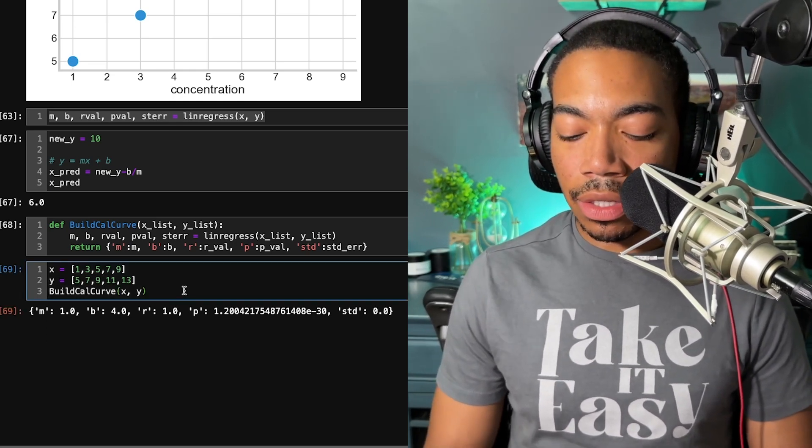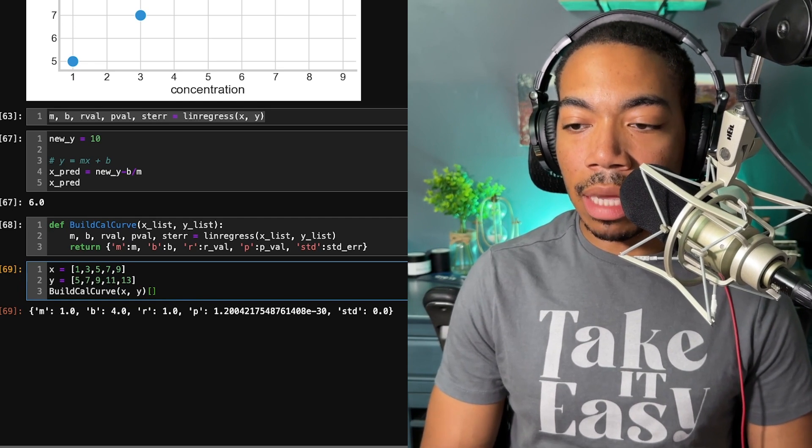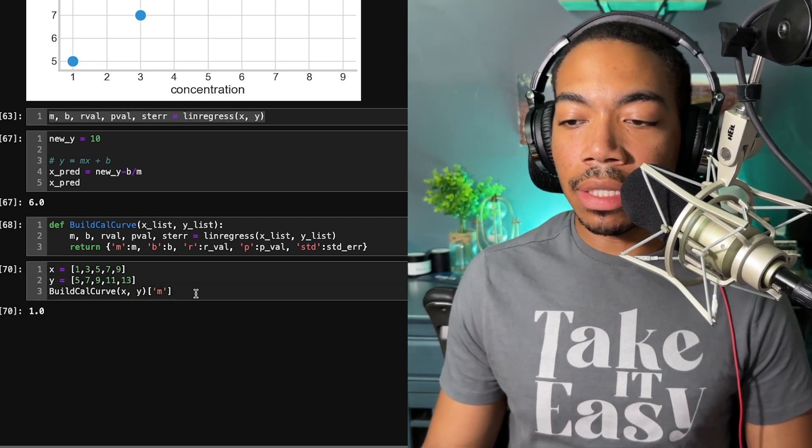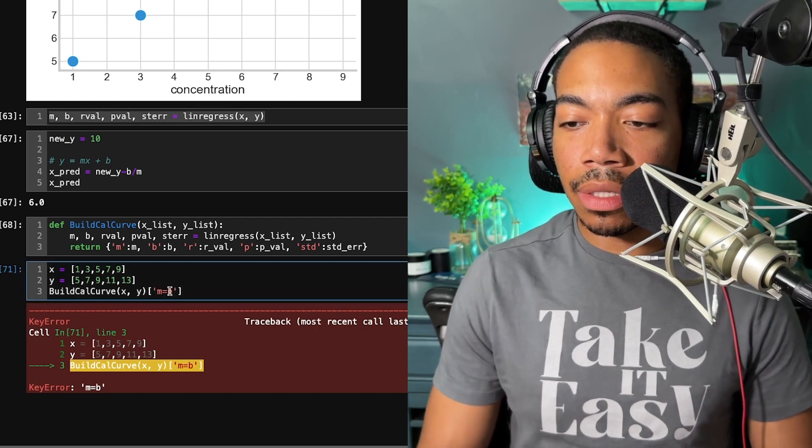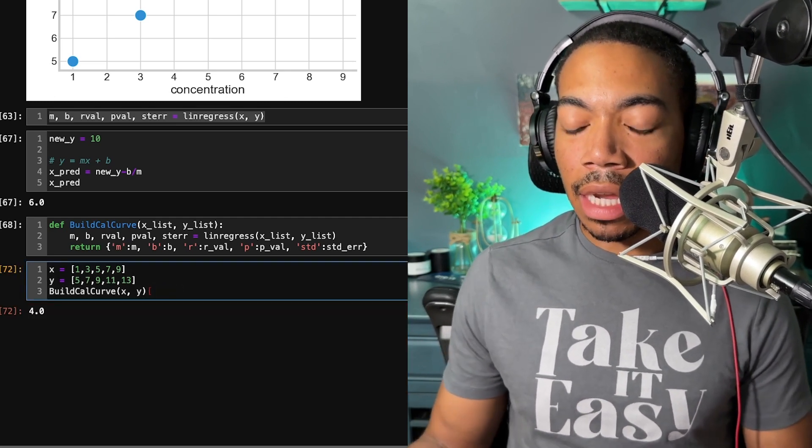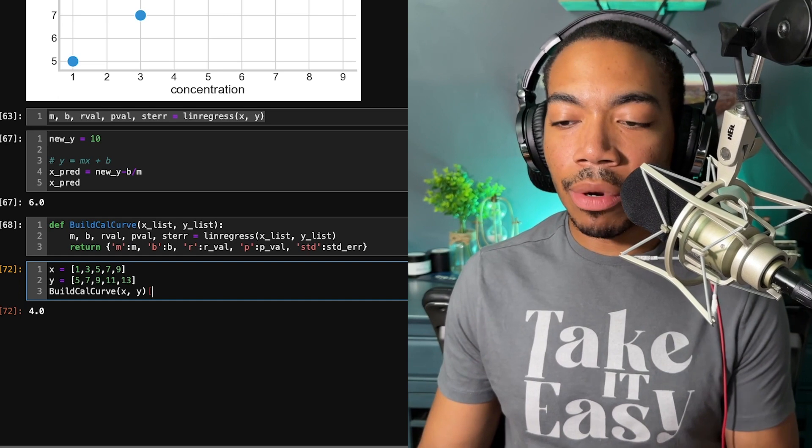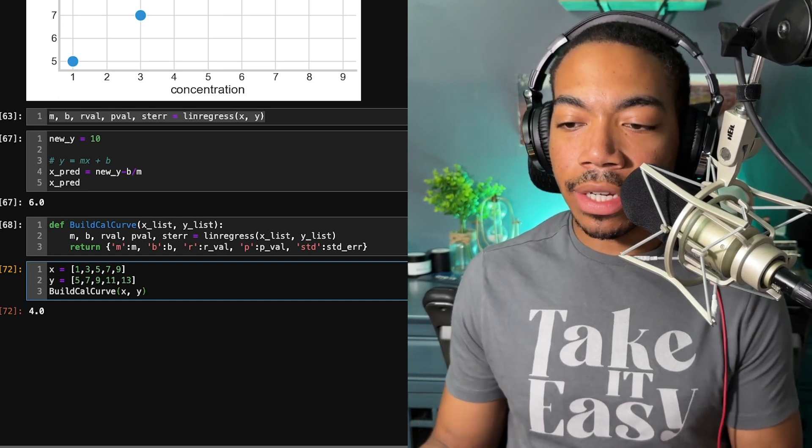If we take advantage of this, the structure allows us to look at just m. So this dictionary has various keys that are consistent with the values that they represent. And let's now make a second function that will take this calibration curve parameters and actually solve for x.